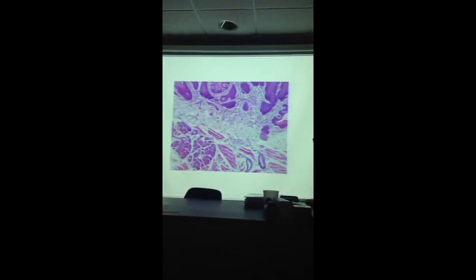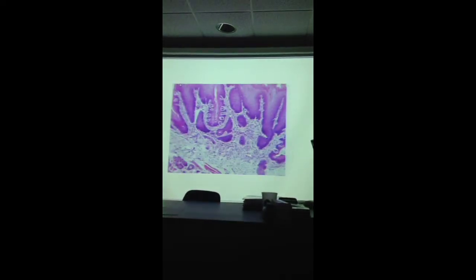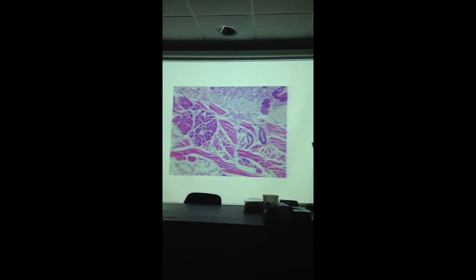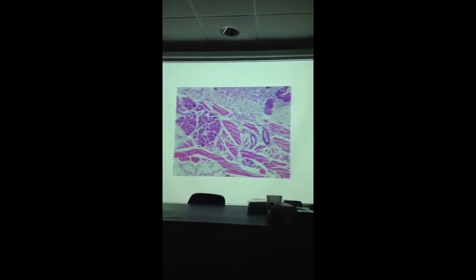And then again, if we look deep here in the connective tissue, we can see again these purple stained cells. What are they? These are the serous cells again. What kind of secretions? Thin, watery secretions, high in salivary amylase. Okay. Here's the other type of cell, though. Now, what kind of cell is this?